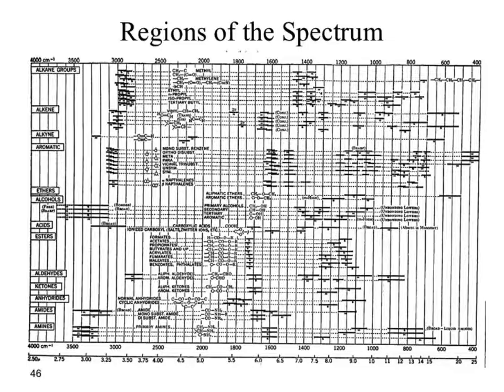So, what do we see here? You're like, just a bunch of lines. Look really, really closely. If we look, we've got 400 in the lower right-hand corner. 400 is pretty close to that 500 we were talking about earlier. And in the lower left, what do we have? 4,000. What are we looking at here? This is an IR spectrum that lists individual functional groups and says, what do we expect to see for that functional group?